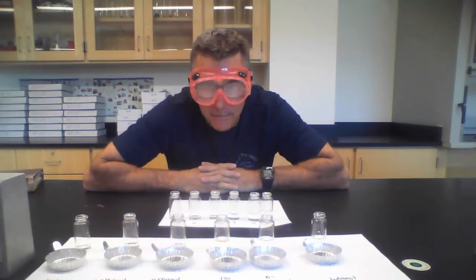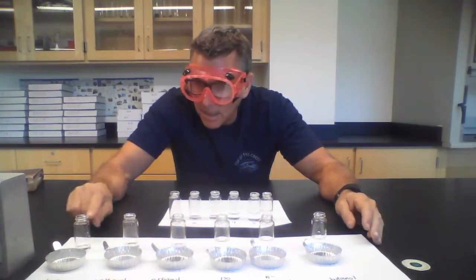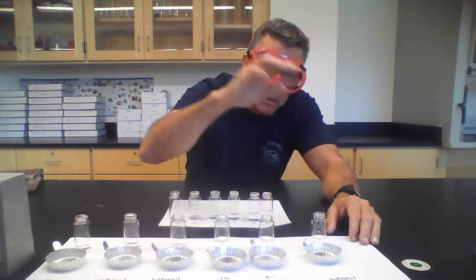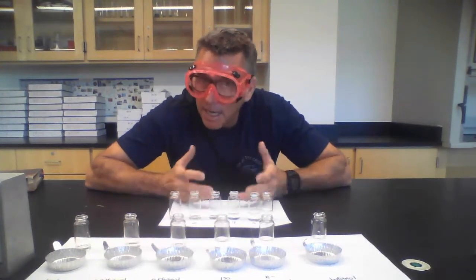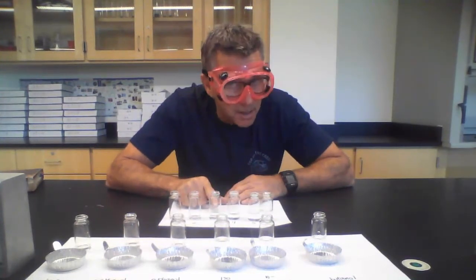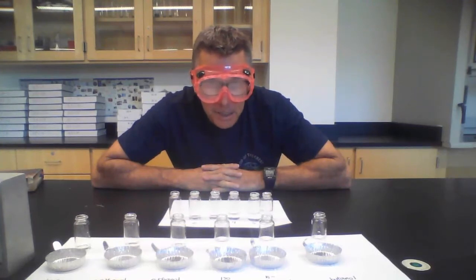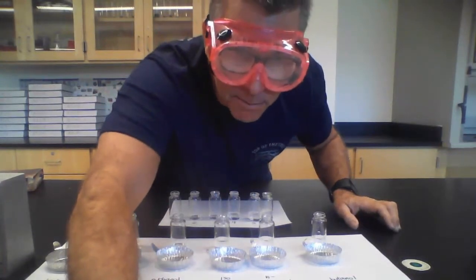B here, and what you see in front of you are 6 known samples. These happen to be water, methanol, ethanol, N-propanol, isopropanol, and butanol. You also have behind them 6 unknown samples, and they correspond to these 6. One of them, perhaps number 3, is water. Perhaps number 6 is butanol. Your goal is to safely identify each substance. So let's have a look. I'm going to pause it and we'll go on to the next spot.